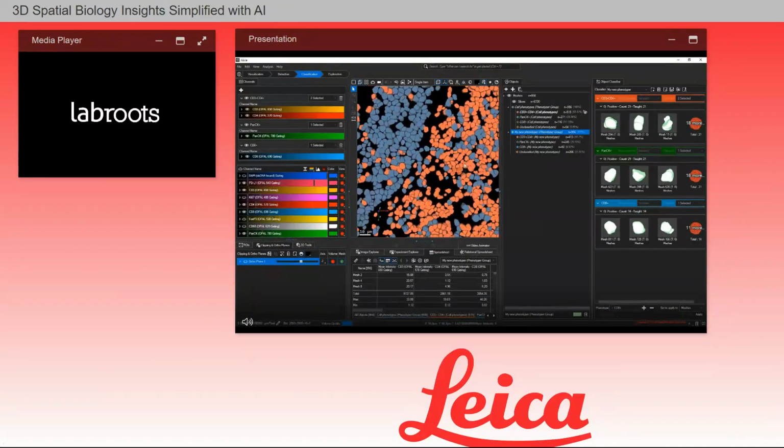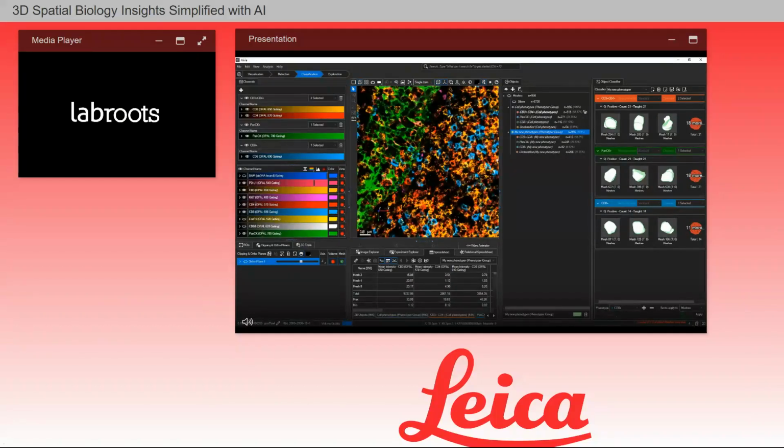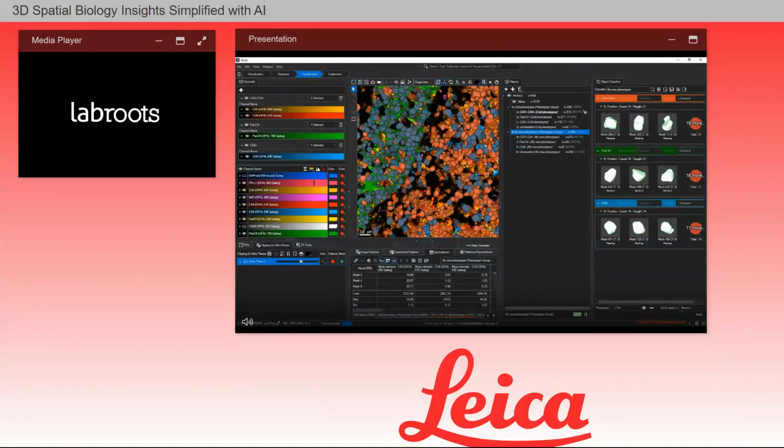For cancer biology or drug discovery, one of the analyses is the effectiveness of my immune cells when it comes to fighting infected cells. From the cell state biomarkers, I can make inferences about immunoactivity in the tissue microenvironment. On this dataset, I have 3 cell state biomarkers: PD-L1 and FOXP3 for suppressing immune responses, and Ki-67 for cell proliferation. Both PD-L1 and FOXP3 may be expressed on my CD4 positive cells to indicate immune response regulation, potentially a pro-tumor response due to active suppression of CD4 activities.